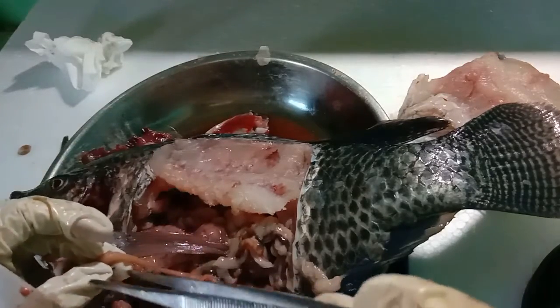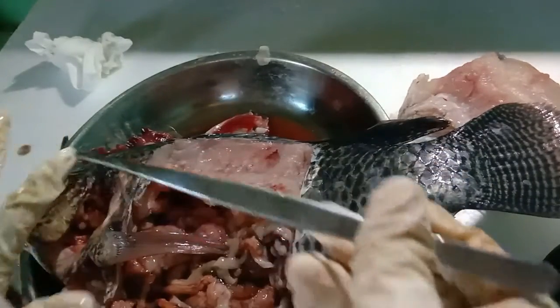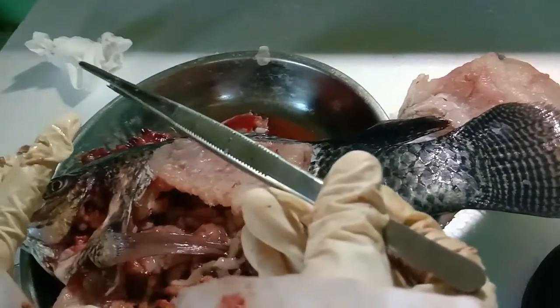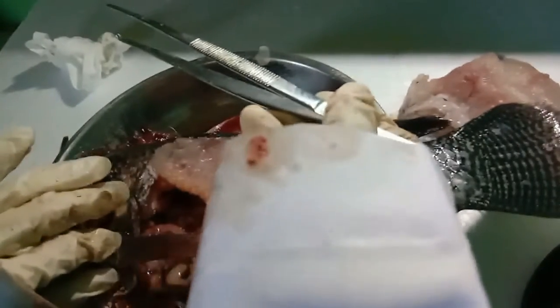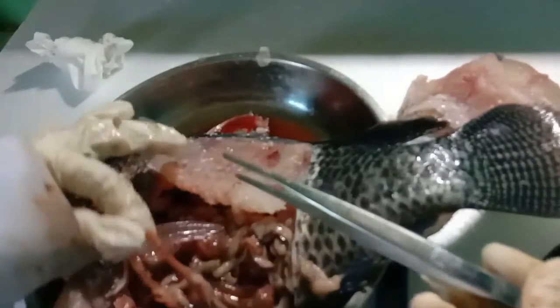So actually the function of the pyloric caeca of fish has been uncertain since their detailed description by Aristotle. He suggested three hypotheses about their function: to store up the food, putrefy it, and concoct it. Or you can say this is for storage, fermentation, and digestion.